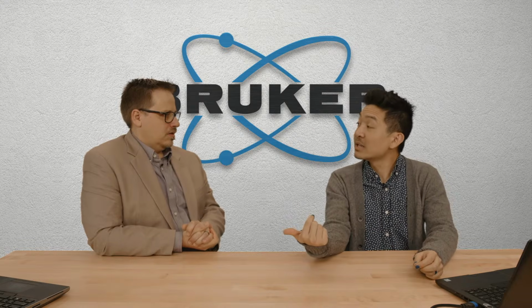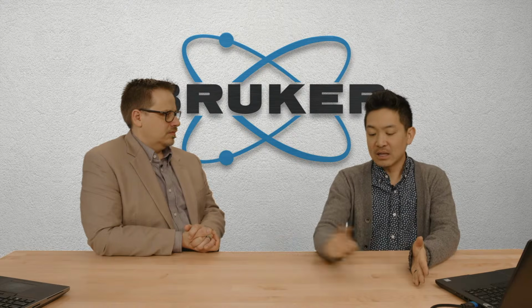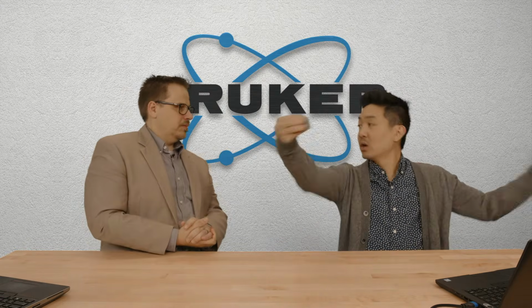Same thing for dquant, our calibration curve software, which we definitely don't have time to get into today. But basically with these fittings, you can do a linear fit, you could do a quadratic fit or something like that. And as long as you have your calibrated values, then you know what that fit curve is. And so anywhere along your process, you can interpolate between them, as long as you have your end members.